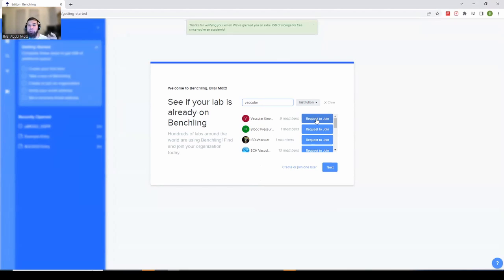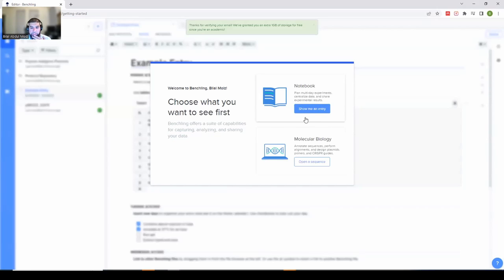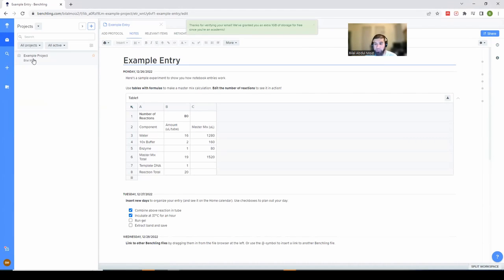One thing I don't really like is that the search feature is a little broken — not ideal. You can make a request to join your lab group, which allows you to view other lab members' calendars or planned experiments depending on what privileges they've given you. This is useful for a lab manager to see what experiments are going on, but it's not something you have to do.